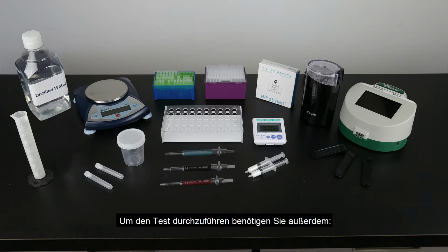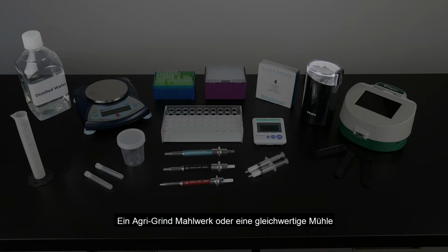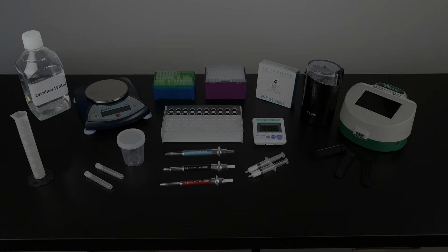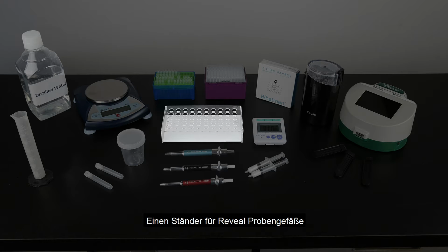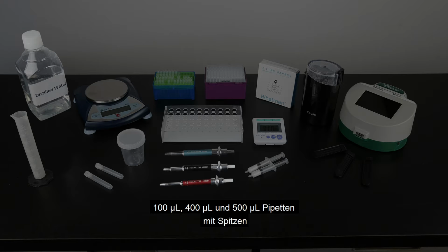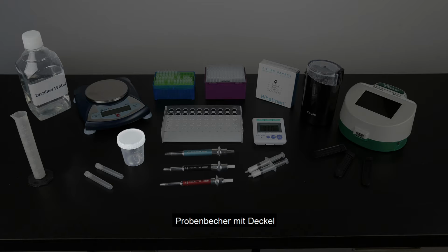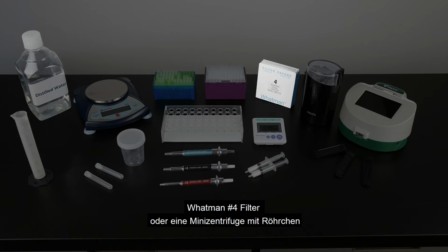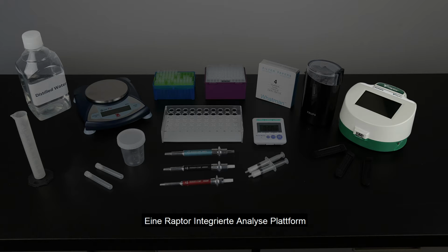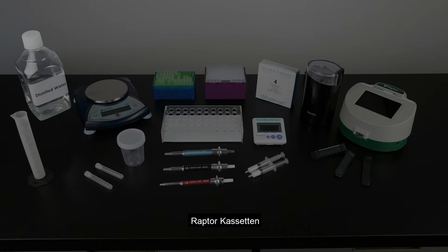To conduct the test, you will also need an agri-grind or equivalent grinder, a scale capable of weighing 10 grams, accurate plus or minus 0.1 gram, a timer, a Reveal sample cup rack, 50 milliliter graduated cylinder, distilled or deionized water, a 100 microliter, 400 microliter, and 500 microliter pipetter and tips, sample collection cups and lids, sample collection tubes and caps, filter syringes, Whatman No. 4 filter paper or mini centrifuge and tubes, a Raptor Integrated Analysis System, Raptor cartridges.